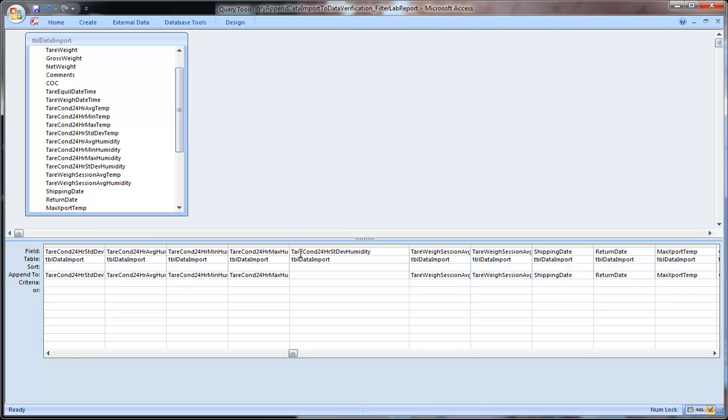conditioning environment. So before it was weighed even the first time, it was conditioned, so the piece of filter paper sat in an environment that had a standard deviation of the humidity over 24 hours be something, and amazingly that has to be tracked in order to verify that you have used a laboratory that follows the correct procedures for weighing PM2.5 filters.